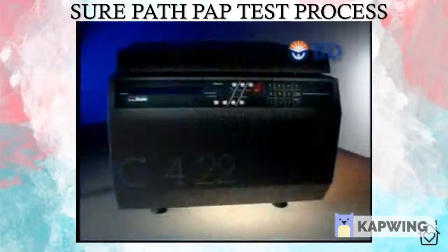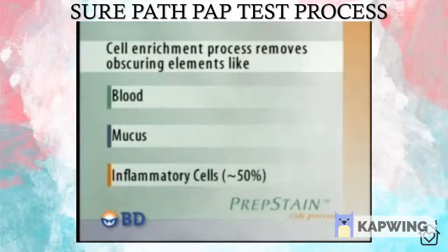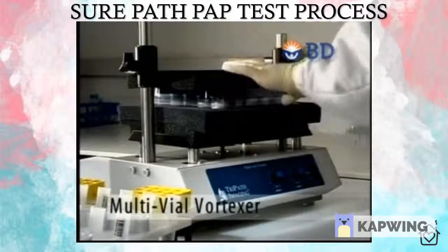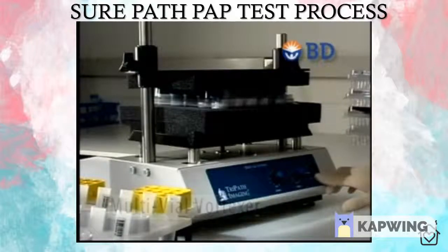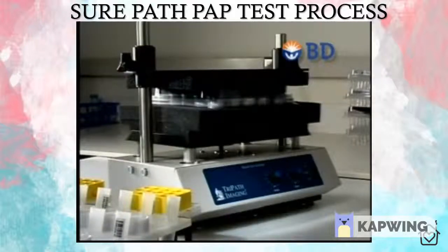Our proprietary cell enrichment process removes obscuring elements like blood, mucus, and inflammatory cells. This process is what provides the SurePath difference in sample clarity and homogeneity as compared to the conventional PAP method. Once accessioning is complete, a tray of SurePath vials is placed onto a multivial vortexer for 15 to 20 seconds. Vortexing randomizes the cell sample, partially disaggregating any cell clusters and helps free any cells clinging to the submersed collection device.